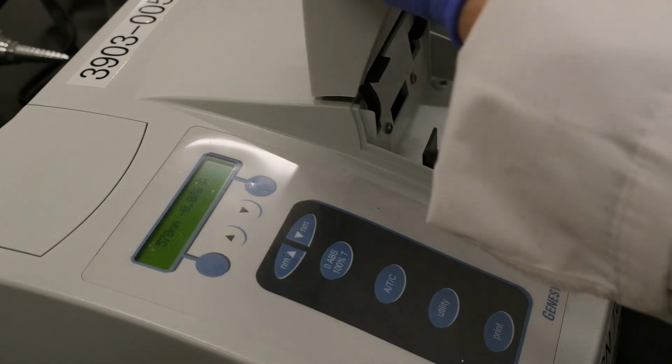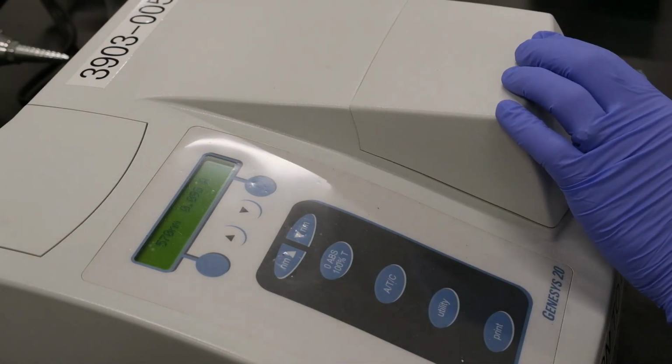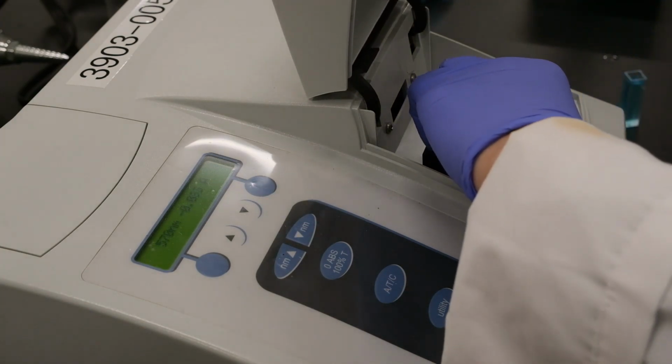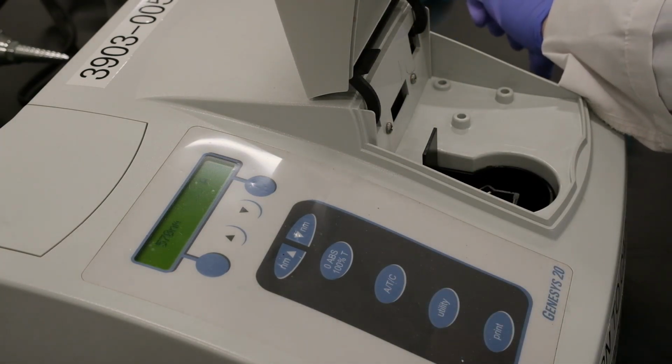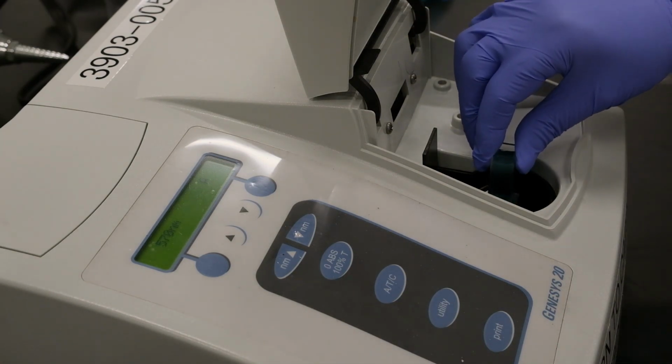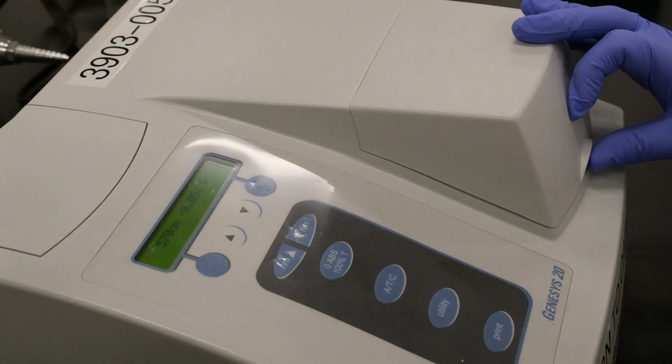Again, tare the instrument, zero the instrument. And again, clean the solution, insert it, and read the new value.